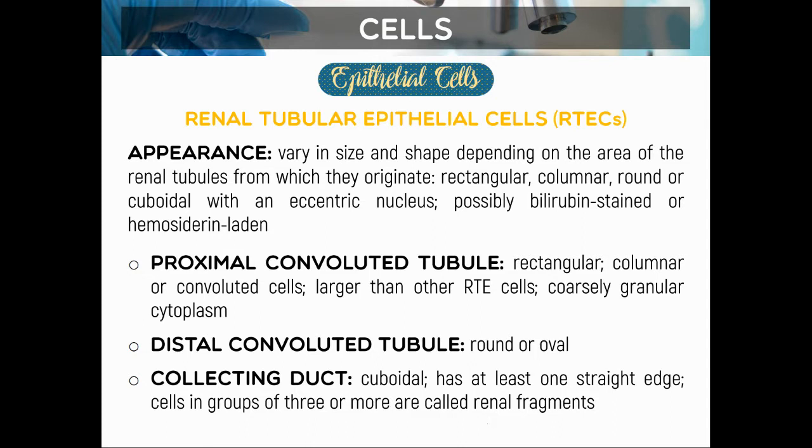For today, we're going to continue our discussion regarding the microscopic examination of urine. This is the last type of cell that we are going to encounter. And for the remaining slides, we are going to proceed with casts and with the urinary crystals.